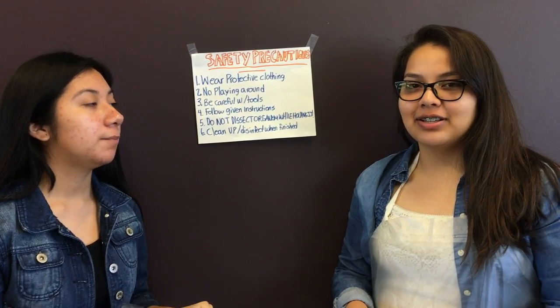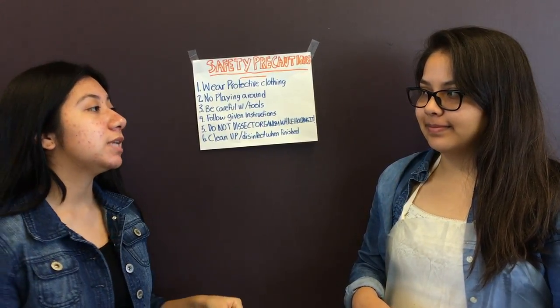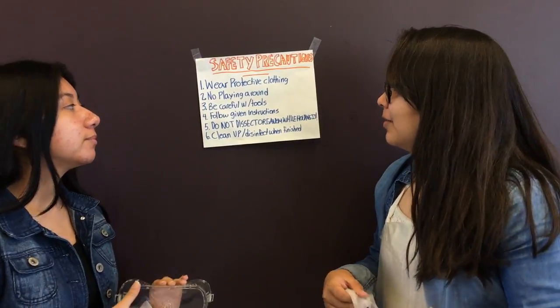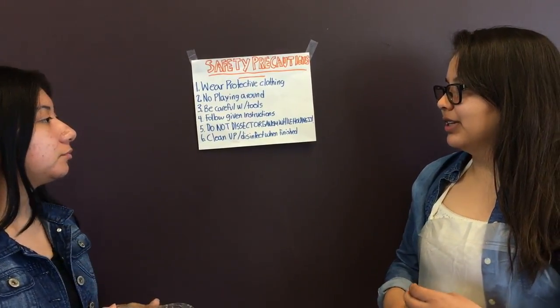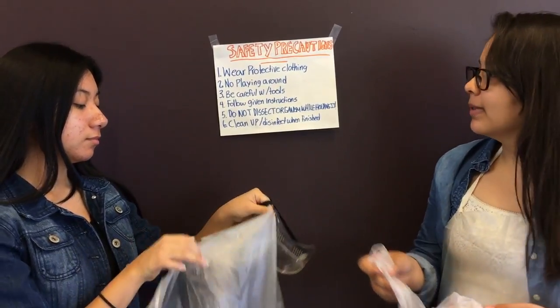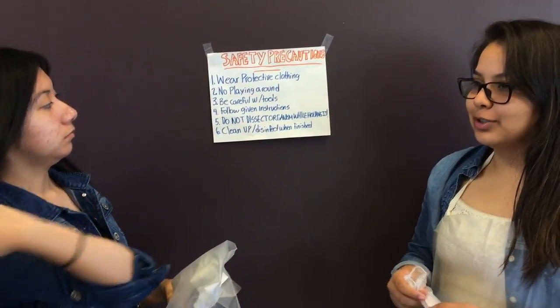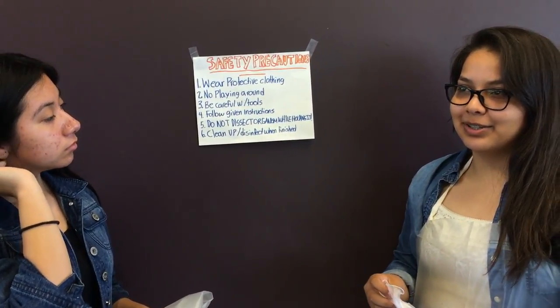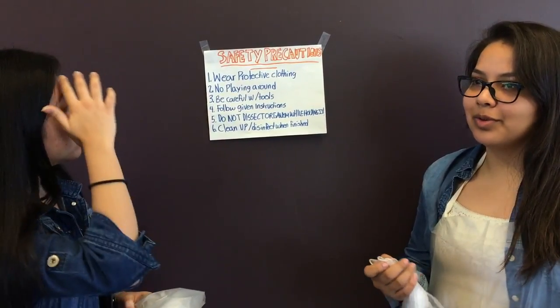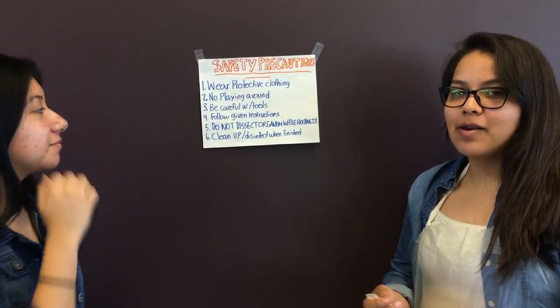My name is Rebecca Gonzalez. And my name is Vanessa Morales, and today we will be discussing the safety precautions for our dissecting lab. One example would be to wear protective clothing such as aprons, goggles, and gloves. No playing around, like don't run around during the lab because you're supposed to be very careful with the organism you're dissecting. Be careful with tools, for example, don't run with the scalpel because you're going to get hurt.